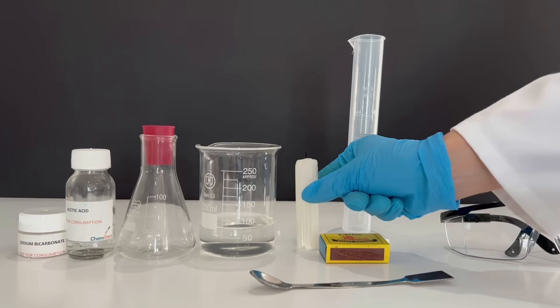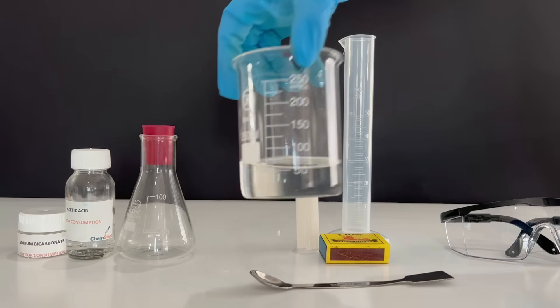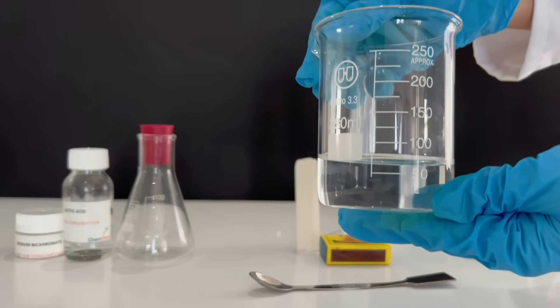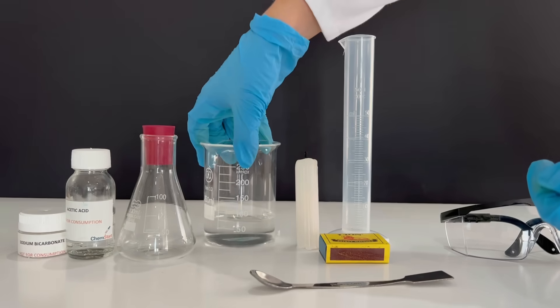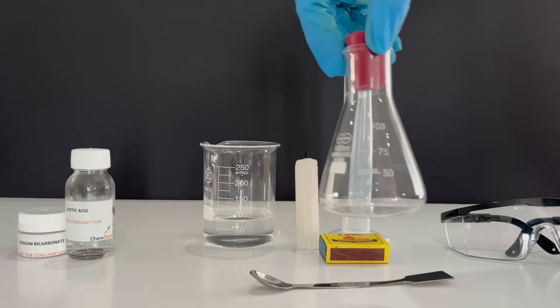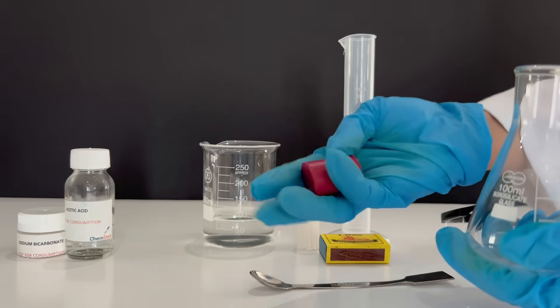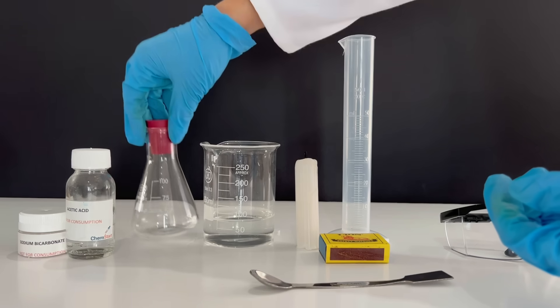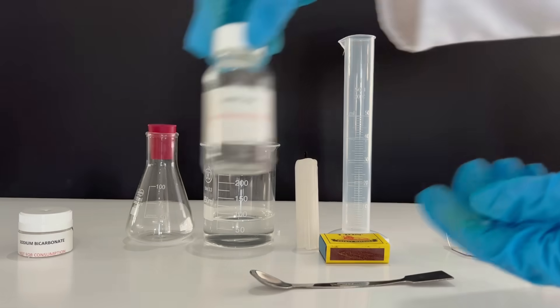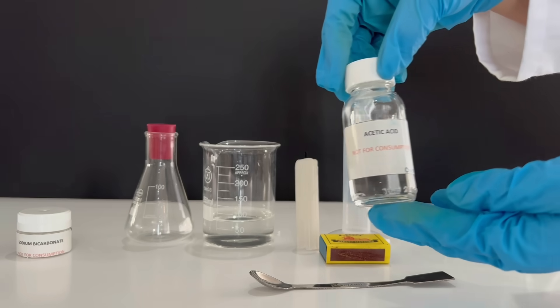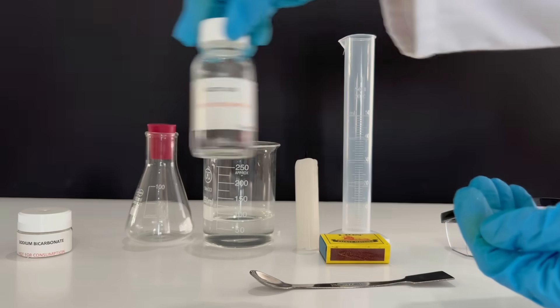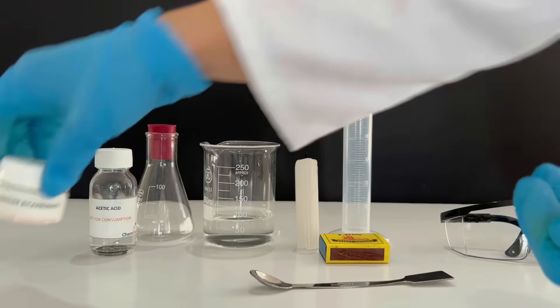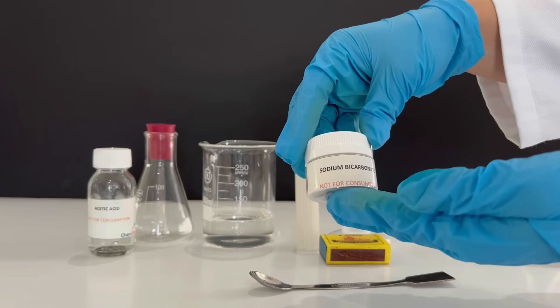You need to have a beaker with water—here we have 75 milliliters of water. You'll need an Erlenmeyer flask with a stopper, it's very important that you have the stopper. Then you need acetic acid, and sodium bicarbonate.